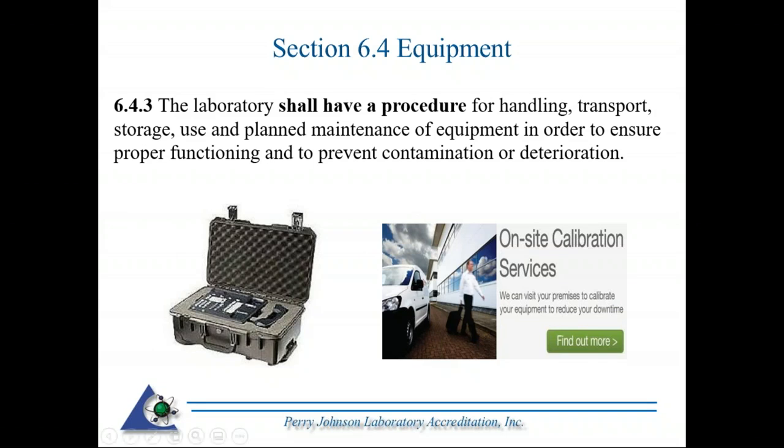6.4.3. There is nothing new here. The laboratory shall have a procedure for the handling, transport, storage, use, and planned maintenance of equipment in order to ensure proper functioning and to prevent contamination or deterioration. Whenever you see "shall have a procedure," it's something in place that tells you how something is done. Particularly for those doing on-site calibration, I like to see a good procedure where somebody could read and understand how you take that equipment, move it off-site, and set it up somewhere else. It should be packed and secured, like in the Pelican case depicted on the left, covering the whole process of packing, transporting, and setting up at the customer's site.